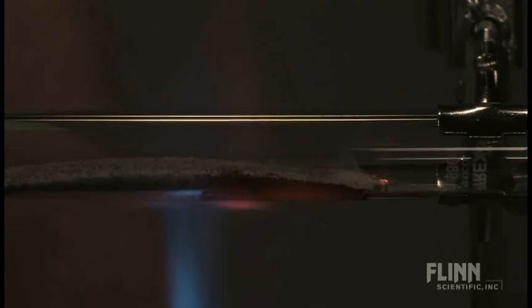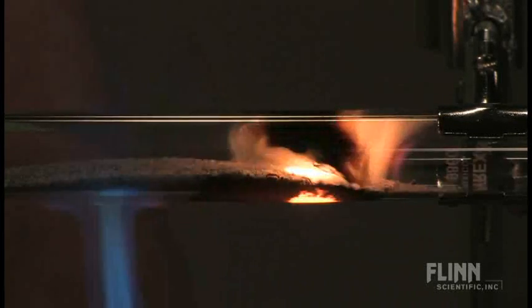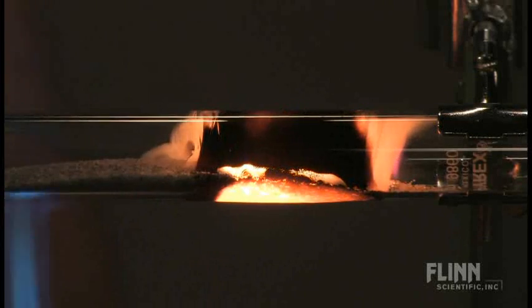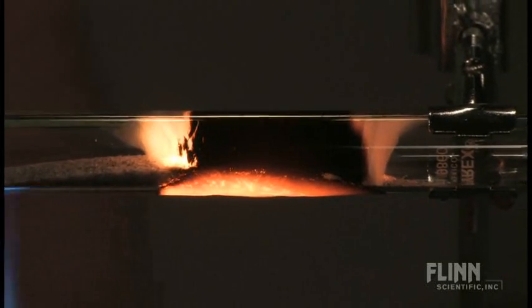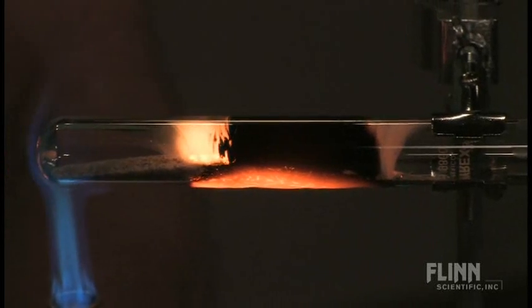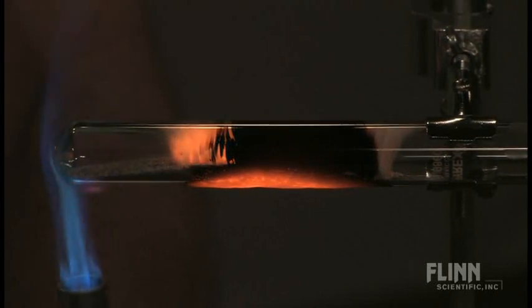Shortly here, I think I'm going to get to the point where this reaction is going to start to take off. Yeah, there we go. You can maybe just hear a little bit of it. Get back into this.